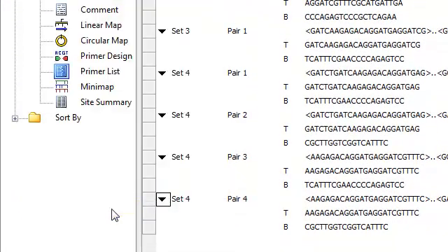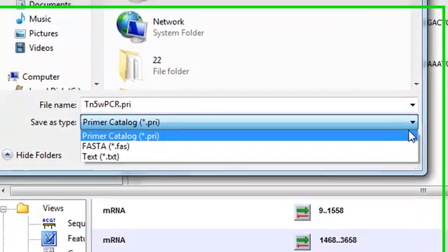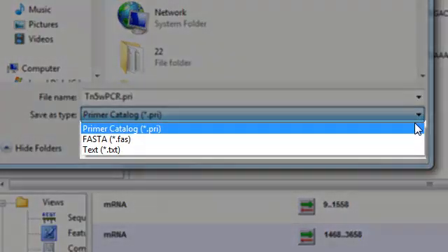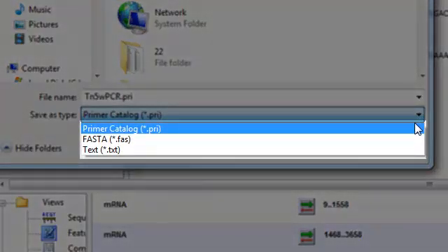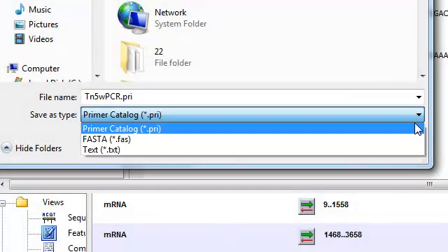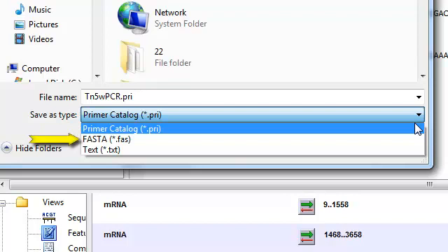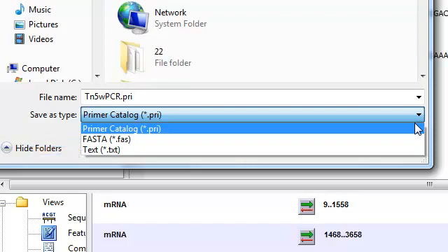And here you can see I'm given three different options for file format. Now if you plan to import this group of primers into SeqBuilder at a later time, then choosing Primer Catalog is the best choice. Choosing FASTA will export all of the primer sequences into a single FASTA file, and choosing Text will create a tab-delimited text file containing all of the information displayed in the Primer List view.